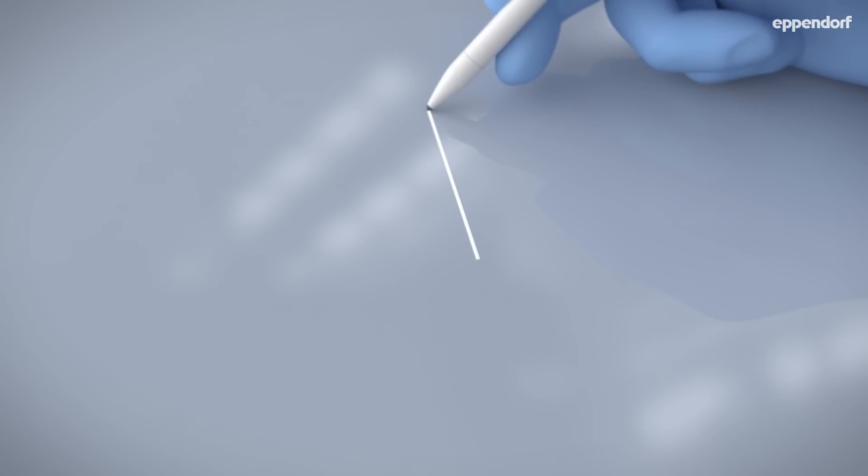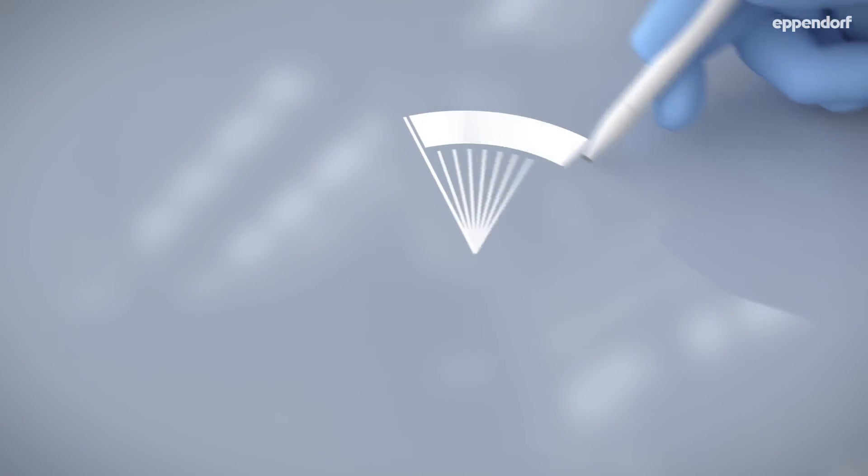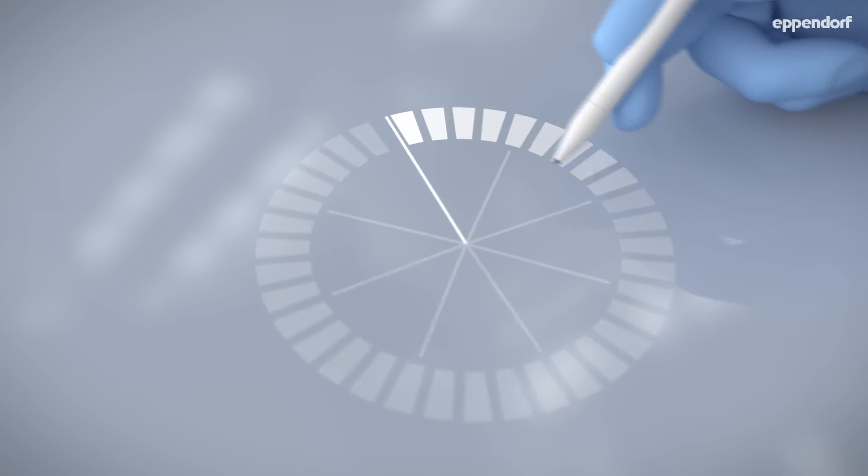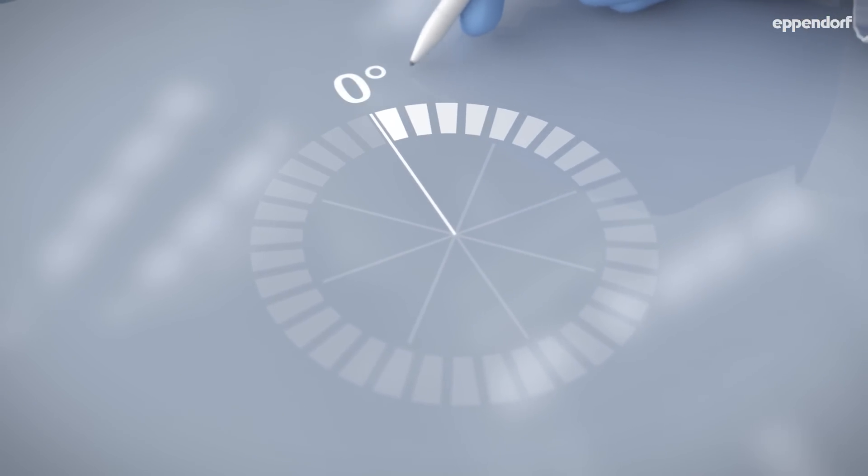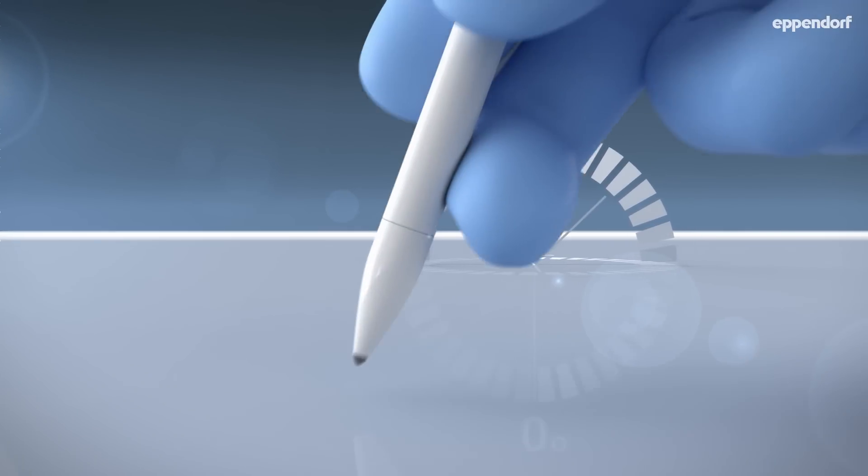Our second topic is the pipetting angle. When aspirating liquids, you need to hold the pipette as vertically as possible. I will show you why this is beneficial with a series of eight samples.